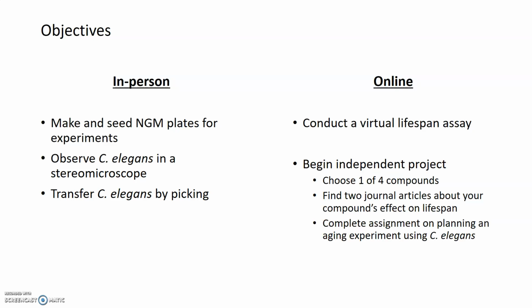And then, rather than conduct a lifespan assay in person, which actually uses a lot of reagents and a lot of time, we're going to do it online, because I think we can get a lot out of it in that way as well. And then you're also going to start working on your independent projects online.